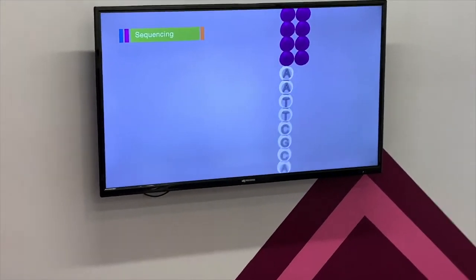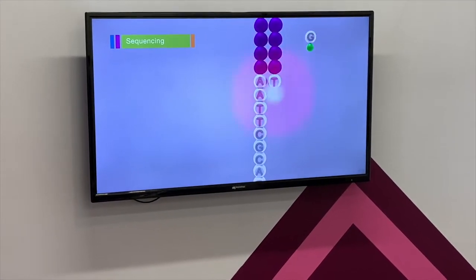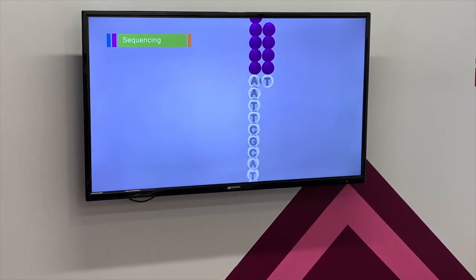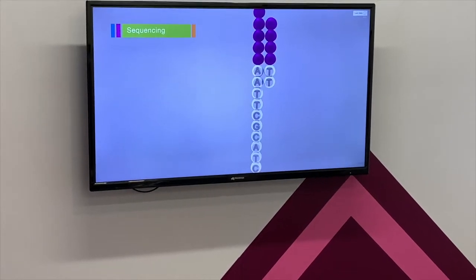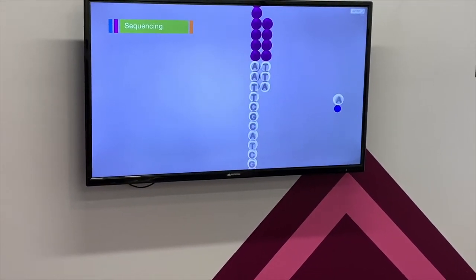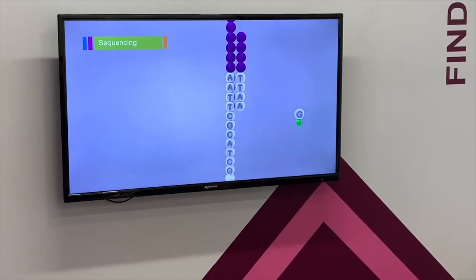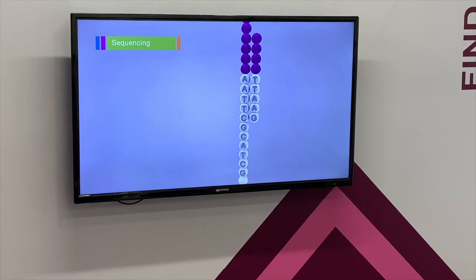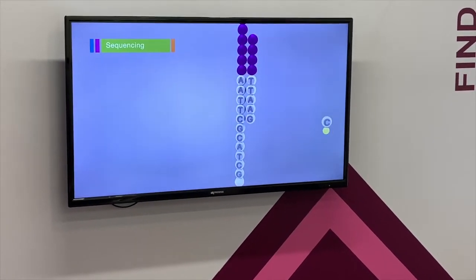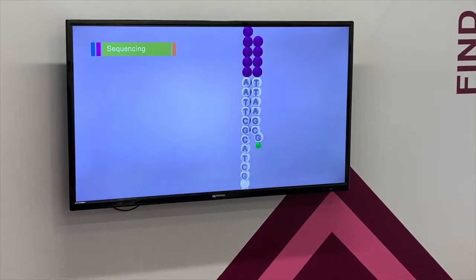Sequencing begins with the extension of the first sequencing primer to produce the first read. With each cycle, fluorescently tagged nucleotides compete for addition to the growing chain. Only one is incorporated based on the sequence of the template. After the addition, it is excited by a light source, and a characteristic fluorescent signal is emitted. This proprietary process is called sequencing by synthesis.